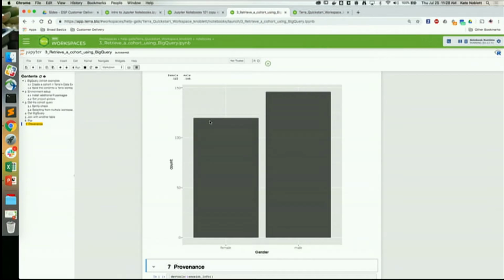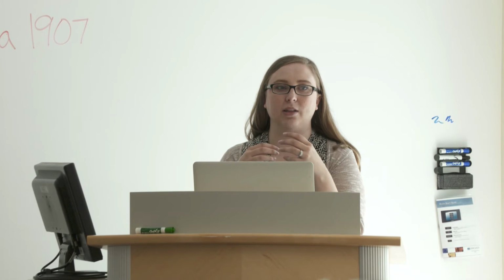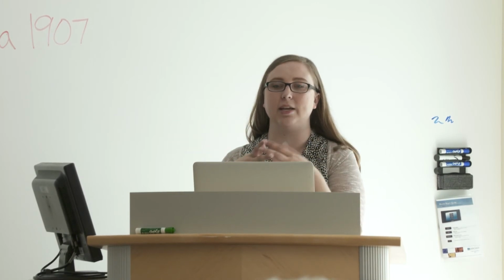So the big reason why we walk you through this BigQuery example is because very often data in the cloud can feel far away. Like you can't interact with it without downloading it, or you can't just quickly look at a file to see some information about it. But using BigQuery, you can pull the data into a notebook and query it, look at some examples, or you can perform some analysis with it. We've just shown plotting, but you can do all sorts of things with it. Whatever you need to do with your cohort, you can do in this method.